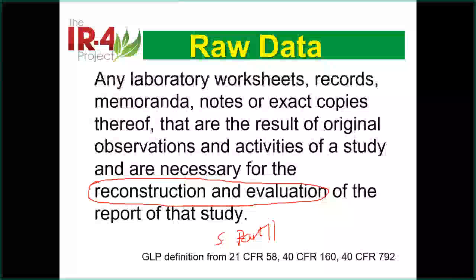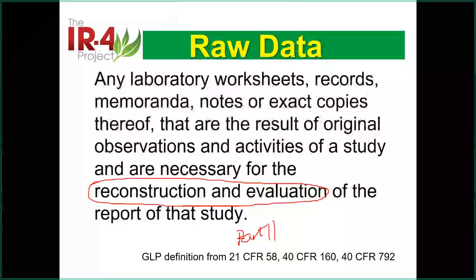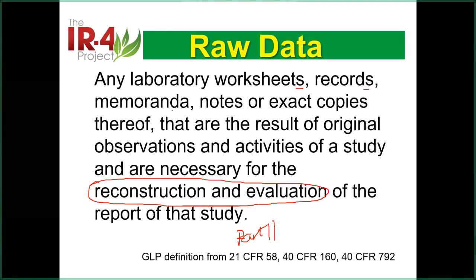So that's the electronic data. If you read it, it should be exactly the same as this. If you have all the electronic related work, you need to have all those things: the work related worksheets, records, all the documentation, the lab notes.